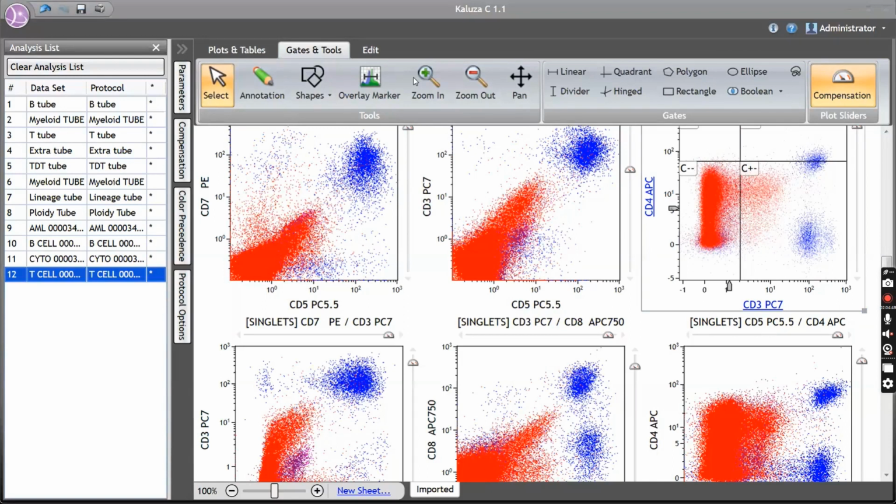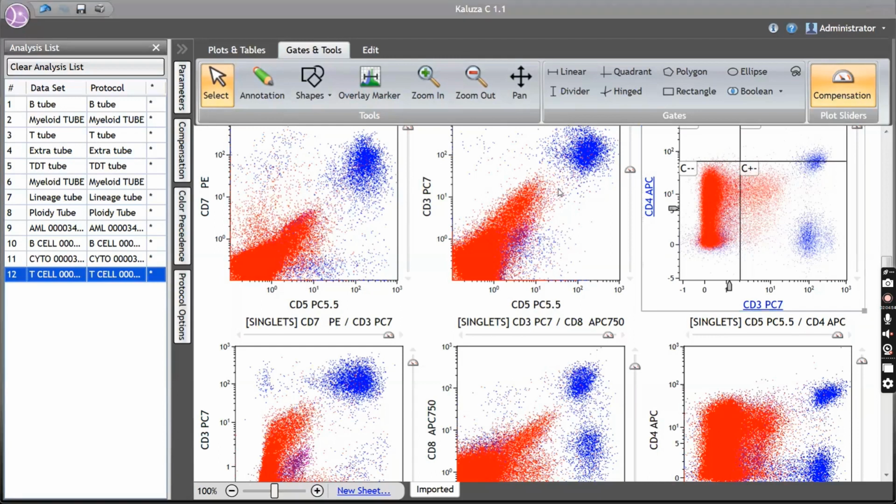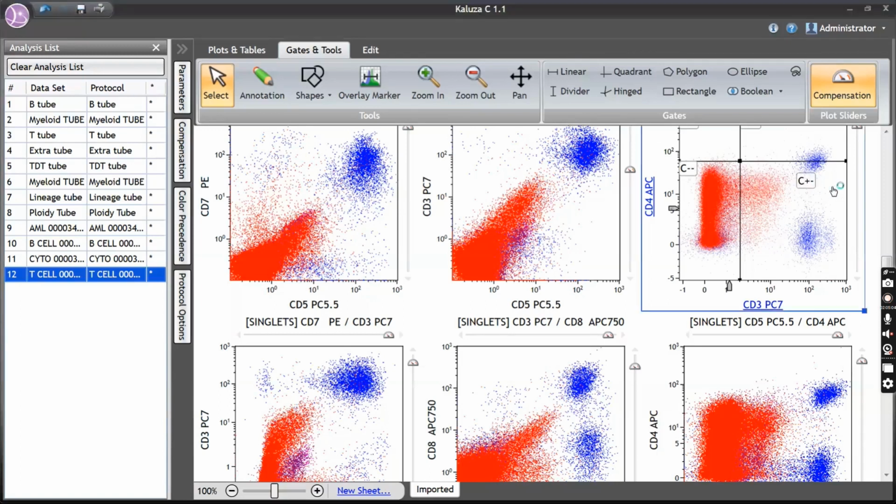So the last case was a bit difficult because it was given as a challenging case. The basic doubt in this case is whether it's a B-ALL with aberrant myeloid markers or an MPAL, B plus myeloid. With these markers, I would go more in favor of a B-ALL with aberrant myeloid markers, but I would love to add more markers before I sign that.